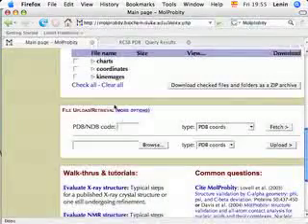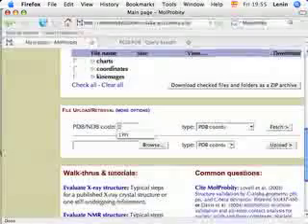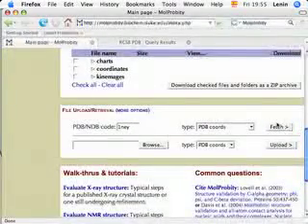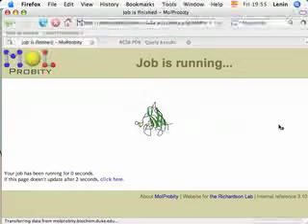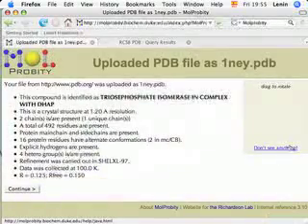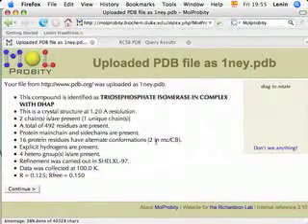Let's recover its PDB ID and process it via MolProbity. We will repeat the process as we did for the previous structure, except that in this case, due to the high resolution of this structure, we will skip the protonation step.